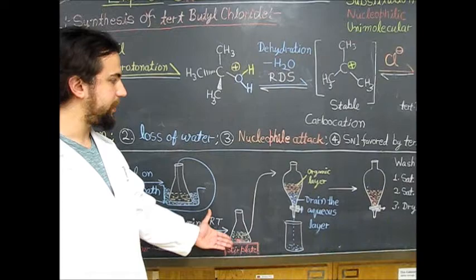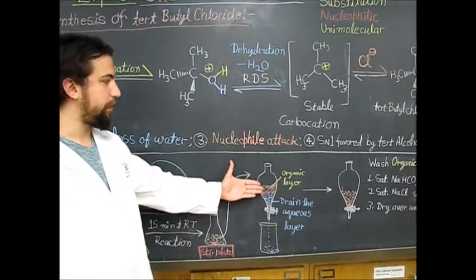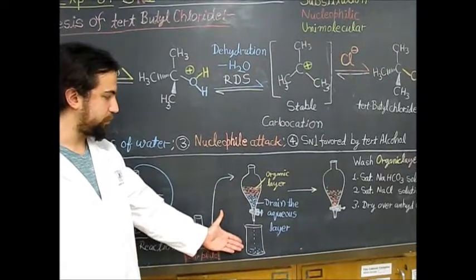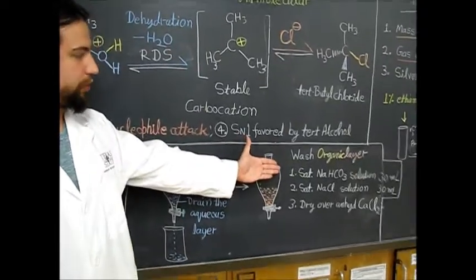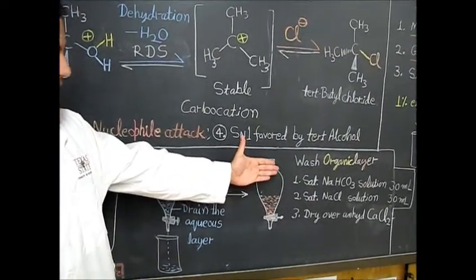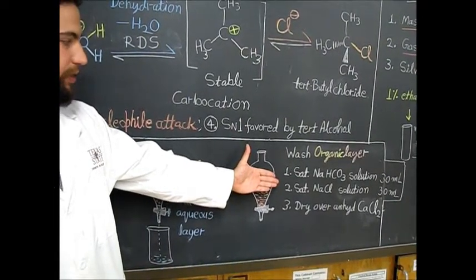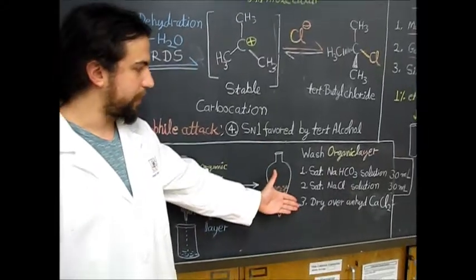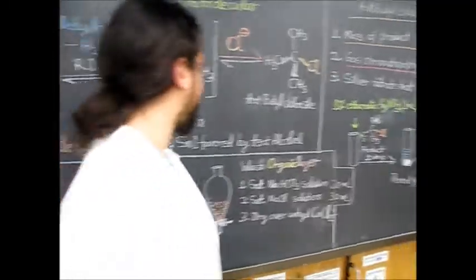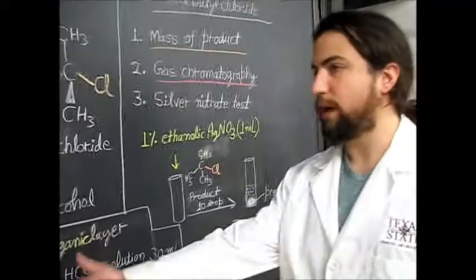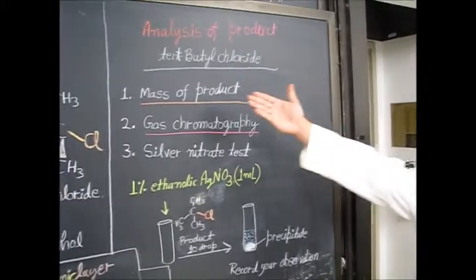Take your product and pour it into the separatory funnel. Perform a wash by first draining the aqueous layer, then wash with 30 milliliters of saturated sodium bicarbonate, followed by 30 milliliters of saturated sodium chloride (brine solution). It can then be dried over anhydrous calcium chloride or sodium sulfate. Once collected from the separatory funnel, we can perform our analysis of the product, which is tert-butyl chloride.